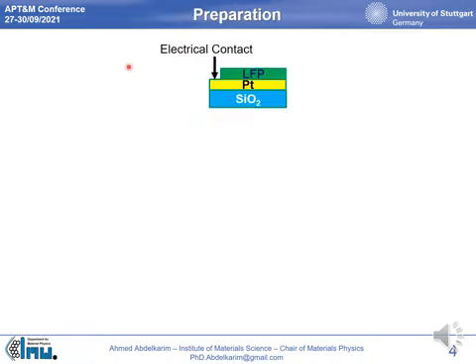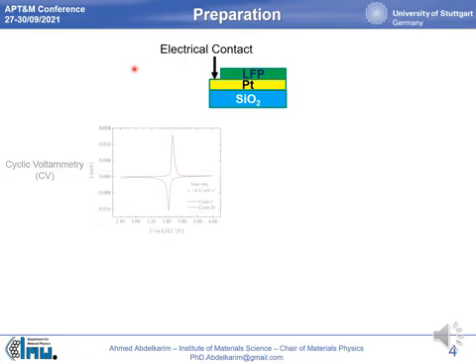After preparing the crystalline LFP, the LFP layer is charged and discharged. At the beginning, the film is initialized at a scan rate of 1 mV per second. Then again it is charged and discharged at a scan rate of 0.33 mV per second for 20 cycles. The figure here shows the second cycle, the red curve, and the last cycle, the blue curve.